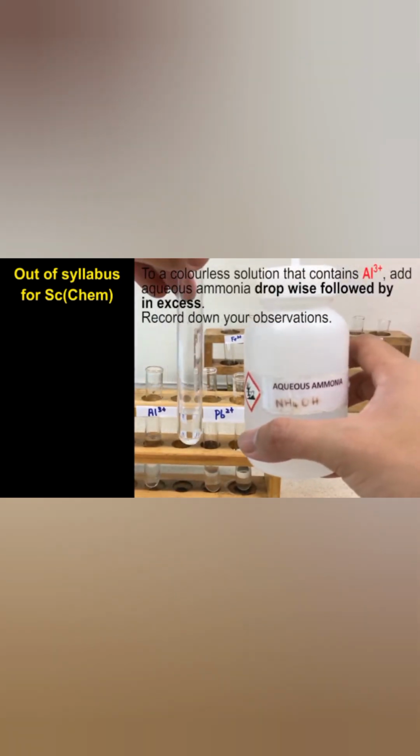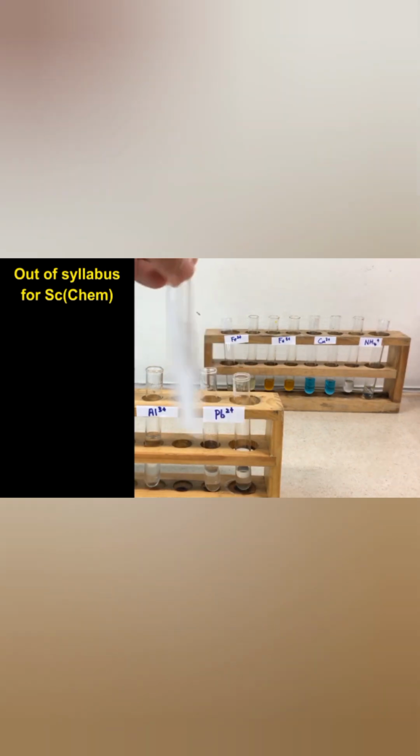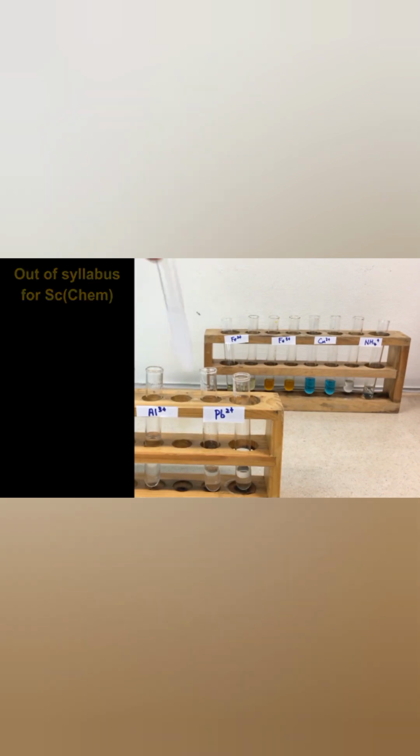Now let's use aqueous ammonia. Adding aqueous ammonia in drop to the solution containing aluminium, a white precipitate is also formed. Adding aqueous ammonia in excess, you shake it, stir it, and the white precipitate remains insoluble. The white precipitate is insoluble in excess aqueous ammonia.